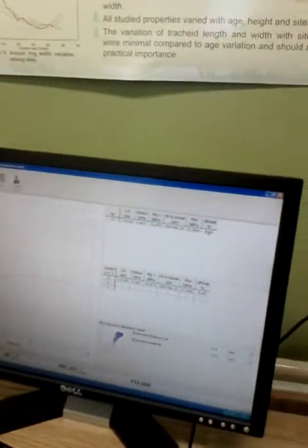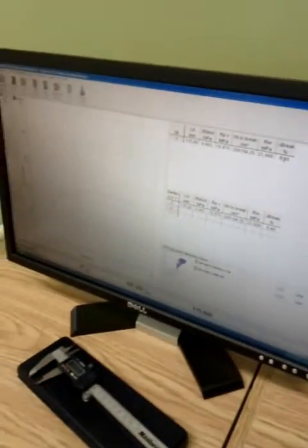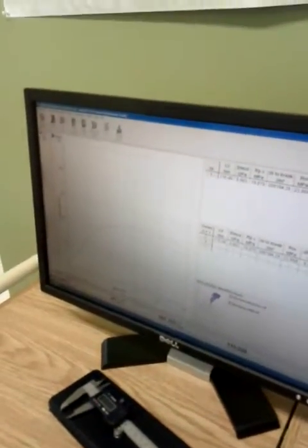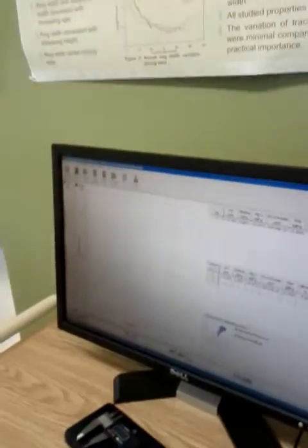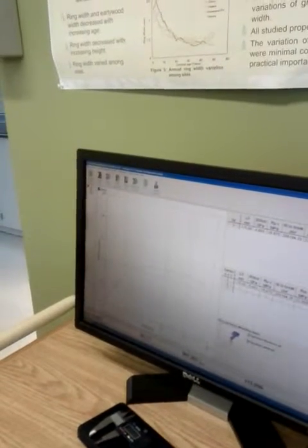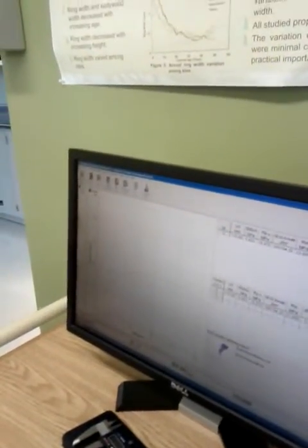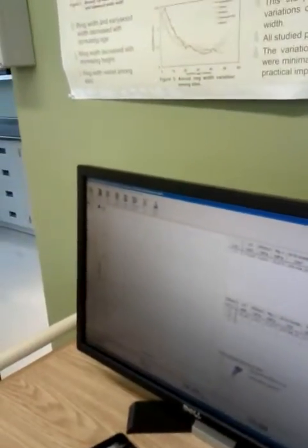Yeah, but what I want to understand is that when we have a higher value, it means the elastic part is much more. It says the linear zone is longer. Exactly. It says what's the maximum stress before we fall into the plastic part. It means the material should be used in the linear part. Otherwise, it would be permanently deformed.